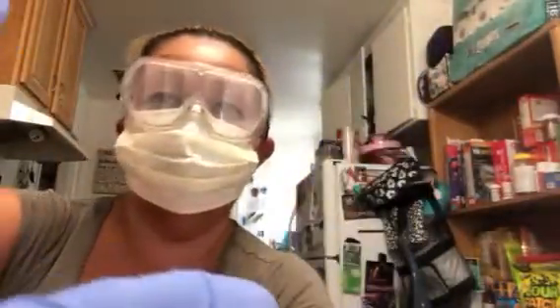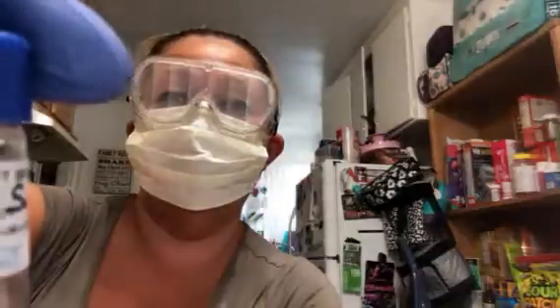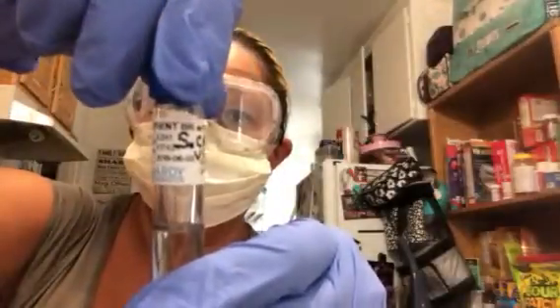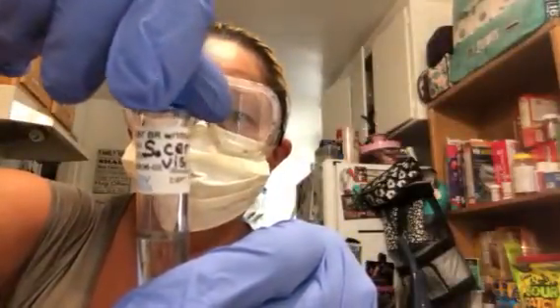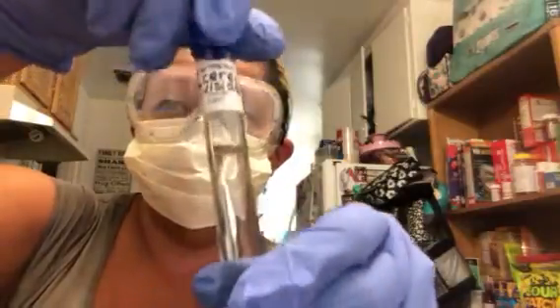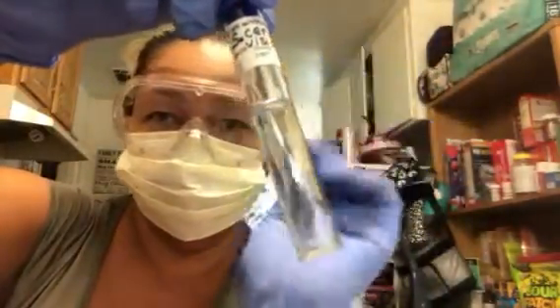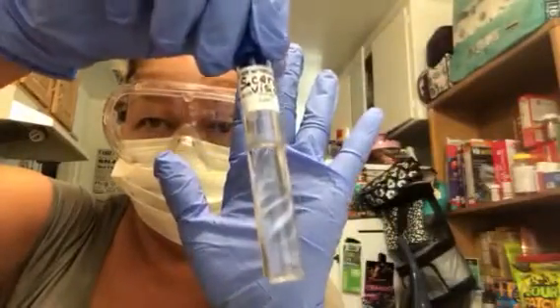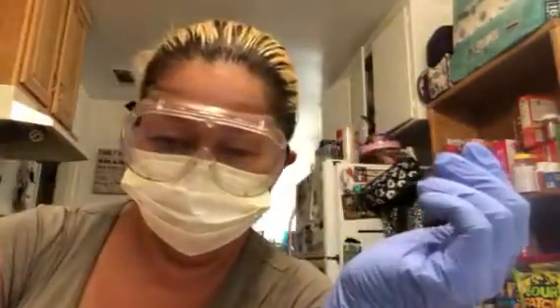And then this is the nutrient broth at 15% NaCl. There you go, you can see it. This is really clear, actually.